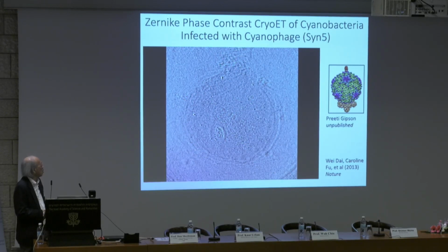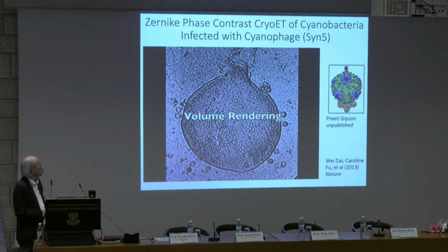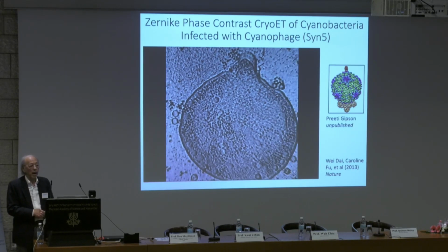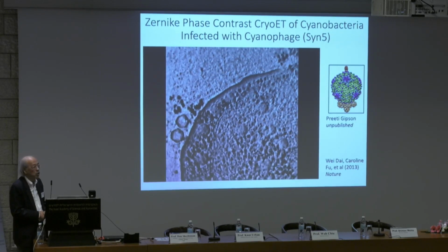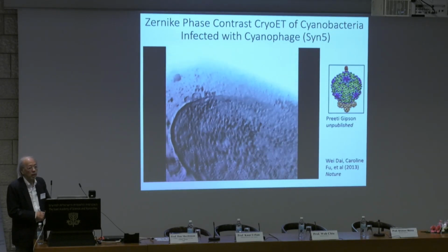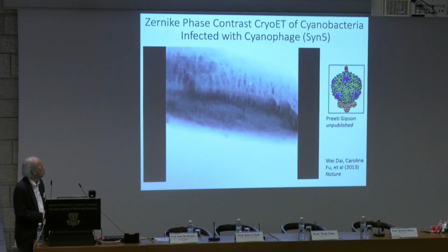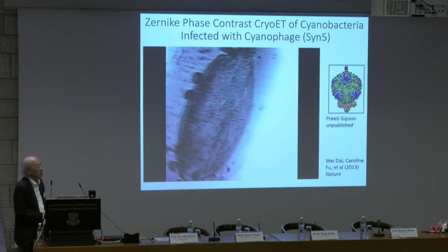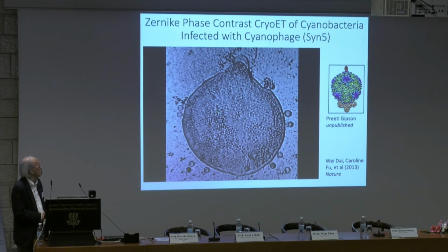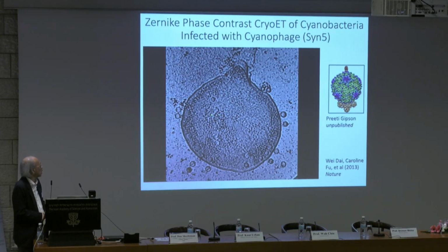And so now, in here is so much information, and if we needed to do it by hand, it would take more than 10 days to color code which feature is which in the cell. But recently we actually developed a deep learning procedure. We can do it computationally in a couple hours. So what I show you is an old annotation by hand.